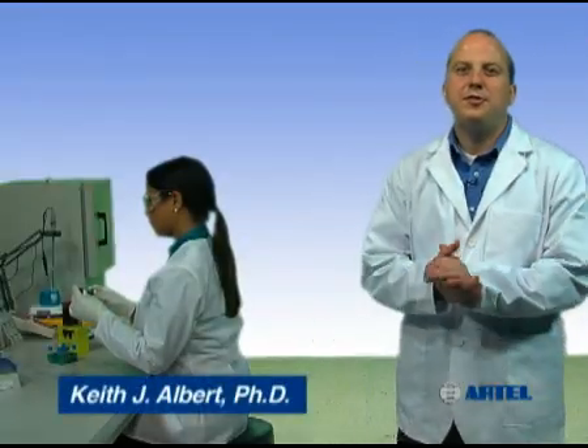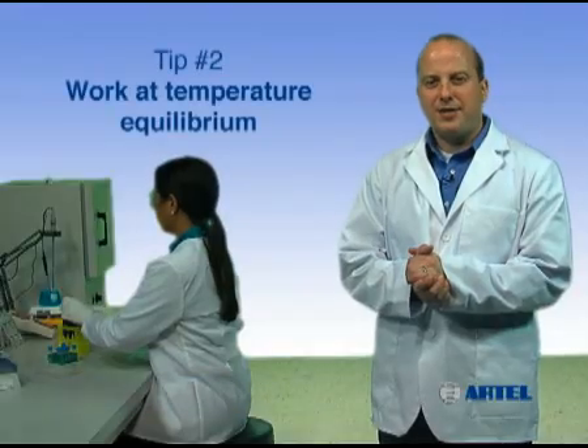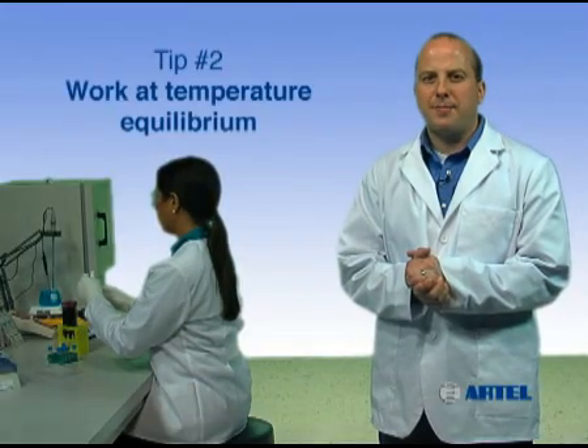Proper pipetting technique helps you ensure confidence in your work so you can trust your results. Pipetting tip number two: work at temperature equilibrium.